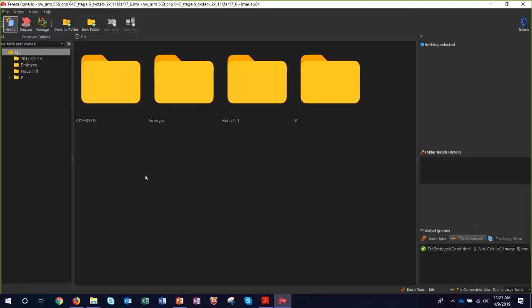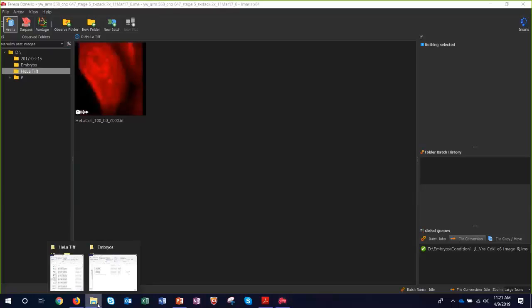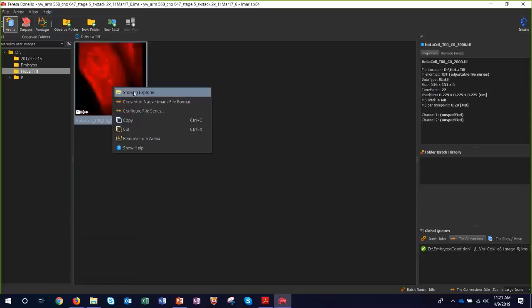Let's see. So some other things that I wanted to talk to you guys about were that not only does it handle just the types of files where you have one image per file, it also handles TIFF files in a special way to make your life easier and to make things easier to visualize. So on this D drive, I have a folder of TIFFs that represent just one data set. Yet, if I look at the original folder, and so I've brought it up here, you can also right-click and do Show in Explorer.